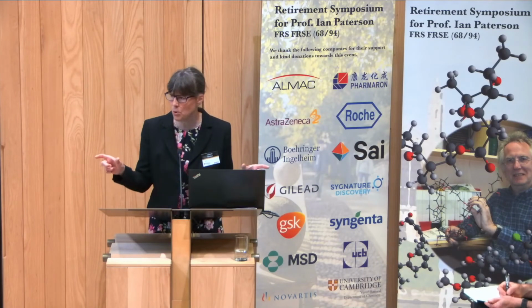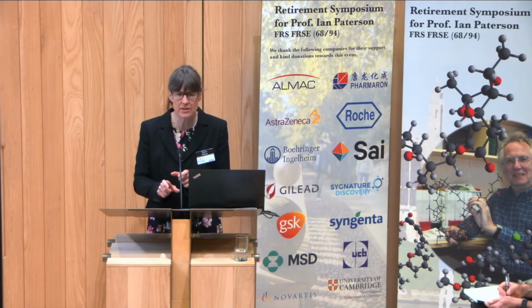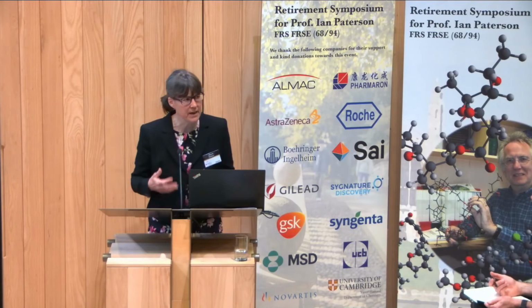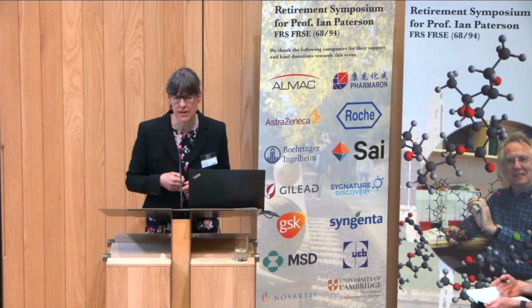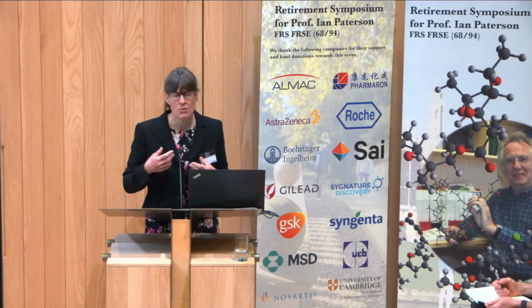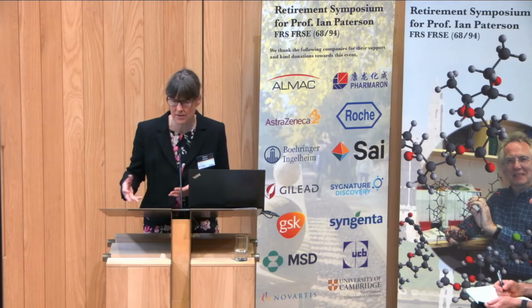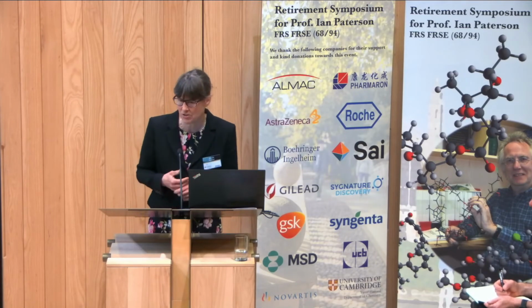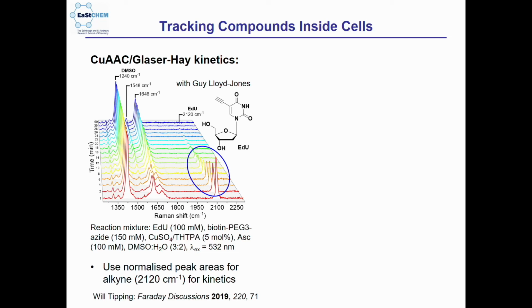So you take 2 smaller components that might more easily diffuse into a cell, and then they react together. So I've always been fascinated by click chemistry and looking at reaction kinetics. When you have one of the world's best kineticists in your department, you go to him. So this work was done in collaboration with Guy Lloyd-Jones. And so I said, okay, well, if we put this EDU inside a cell, are we going to be able to look at the kinetics of click reactions actually inside cells?